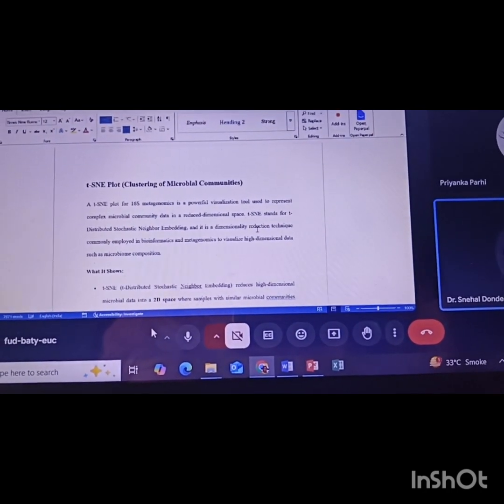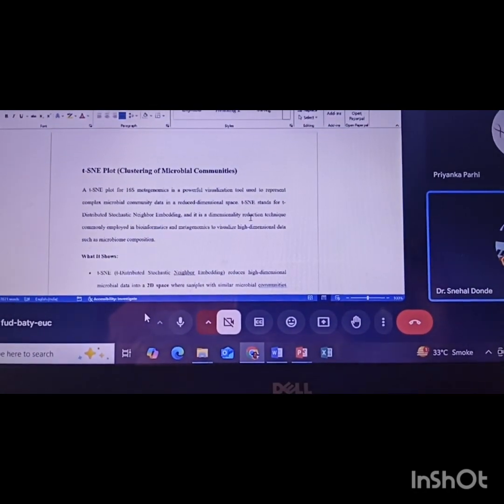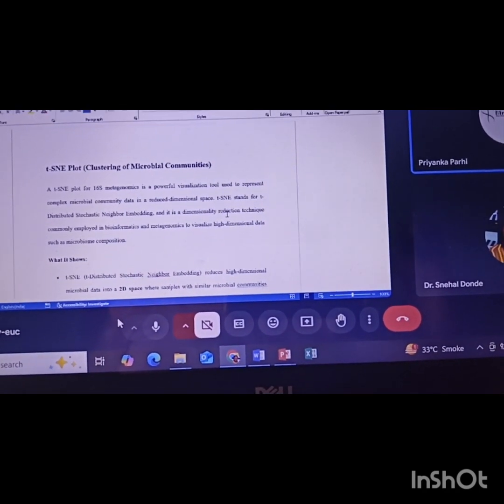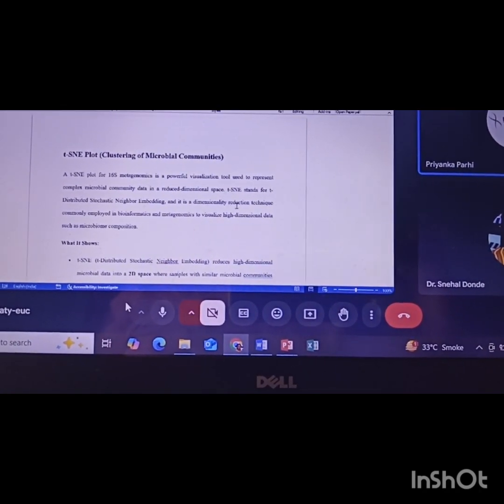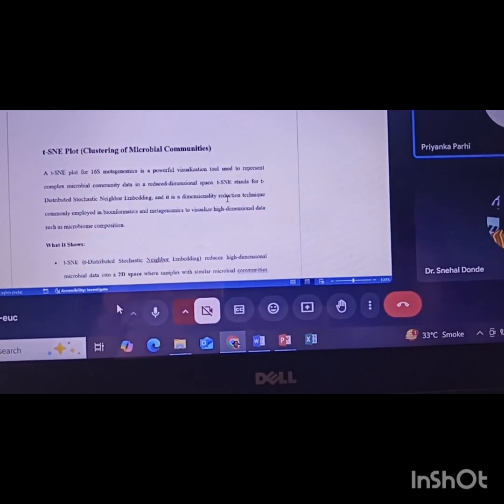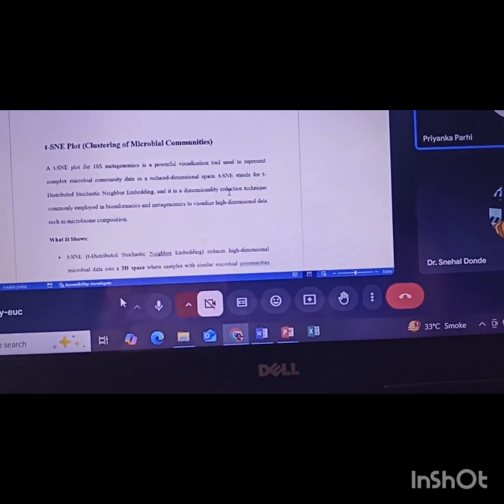That is okay, but if I want to use it for some publication, I can provide you the data. The statistical analysis is also very huge, and I don't know how to even write it in a publication. Most of the time when we publish metagenomics data, we usually skip statistical analysis or write it in one or two lines.